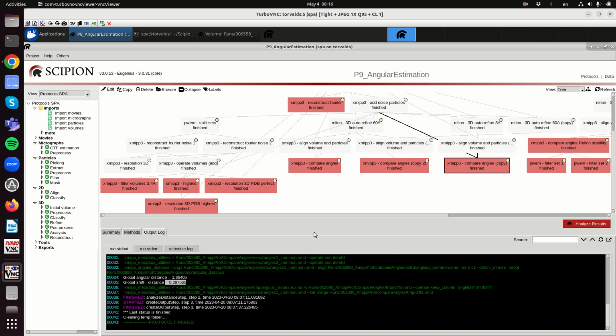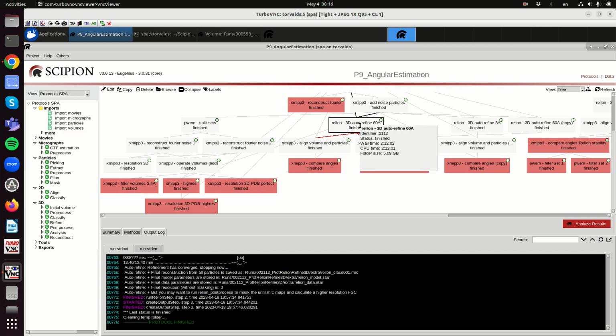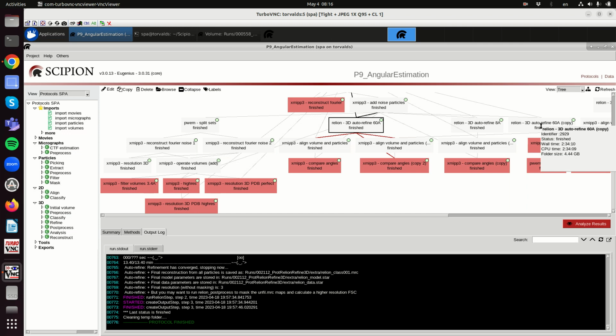And here what we wonder is what about the stability of this assignment. So let's say that I repeat it twice. Should I get exactly the same result twice? These algorithms are not deterministic. They normally have a random initialization, so we know that we will not have exactly the same solution.